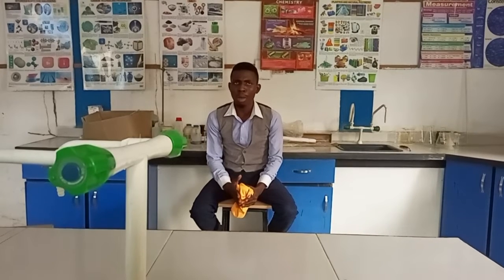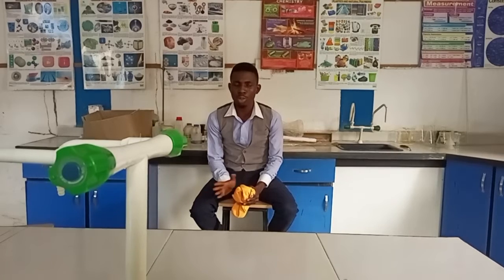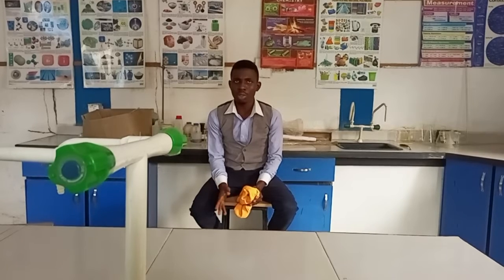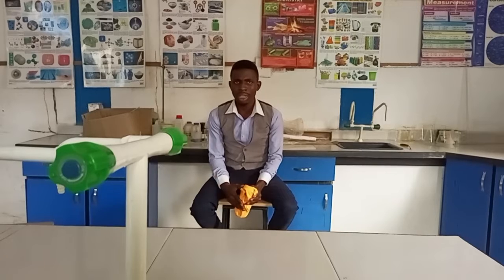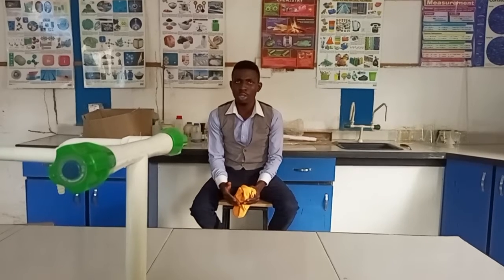If in your question you have been provided with a strong acid and you are also provided with a strong base, in your titration experiment, you are expected to make use of any indicator, because the titration is between a strong acid and a strong base. Now, what are the indicators you are expected to use? You can make use of methyl orange, you can make use of methyl red, and you can also make use of phenolphthalein. Now, indicators are weak organic acids that change color according to hydrogen ion concentration.